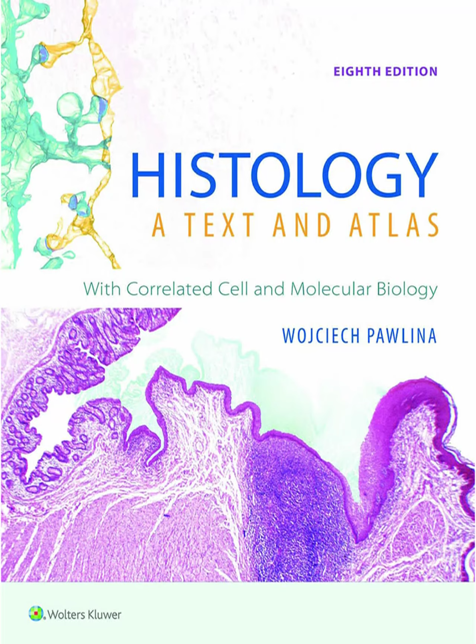Okay, but there are ways to see unstained things. Yes. Beyond basic bright field, there are several other specialized optical systems that are really clever. Phase contrast and differential interference contrast, often called DIC or Nomarski optics. These are amazing because they let us examine unstained specimens, even living cells. Living cells? How?